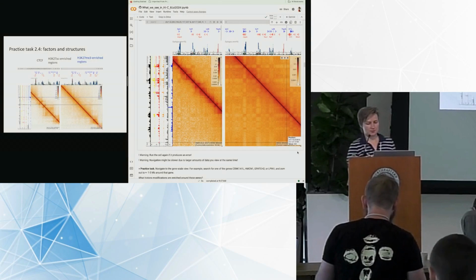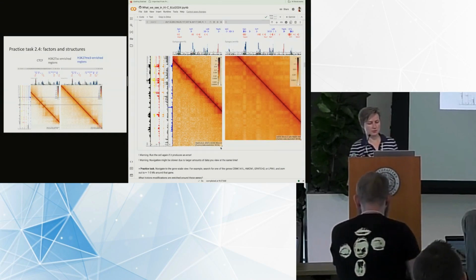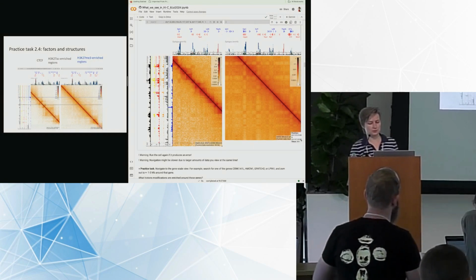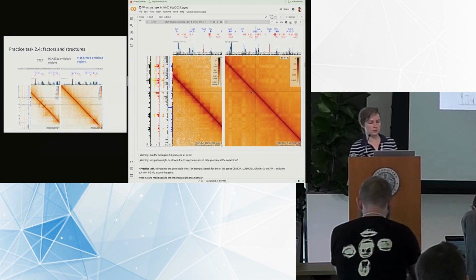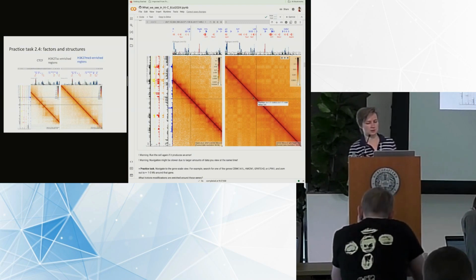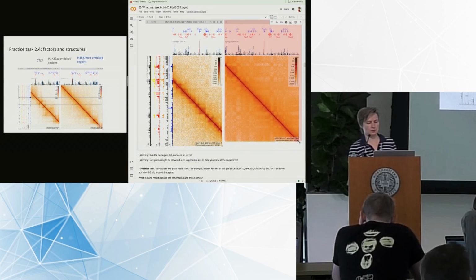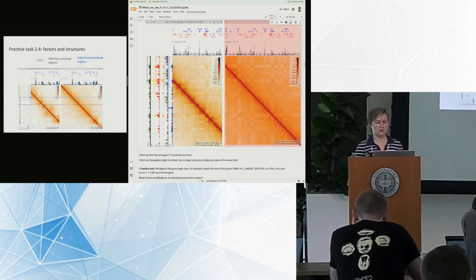If you see this trouble, that the views are a little bit asynchronous, you may notice that the bottoms of these two views are not coinciding. So you can just pull a little bit the one which is smaller, and then it will make them equal in size, and it will be much more helpful to synchronize them and view the features simultaneously. Again, it's this lower corner that you can pull a little bit and make sure that they're the same size. It's just a small tip that you can use to optimize the HiGlass view.